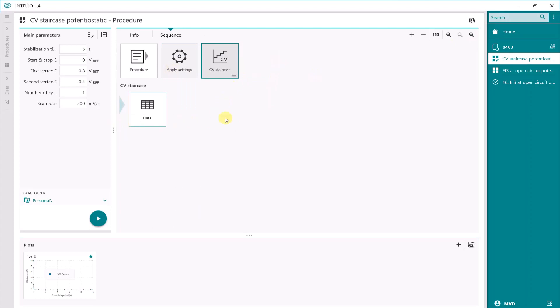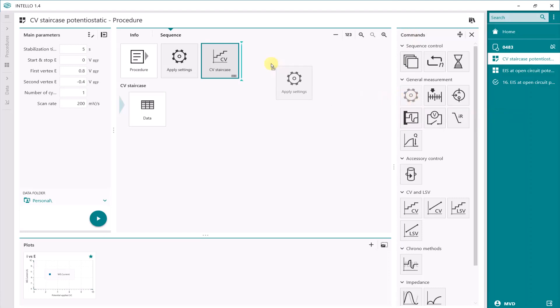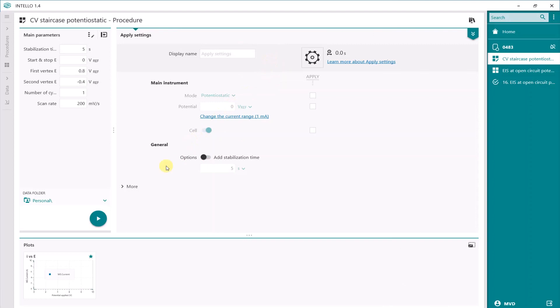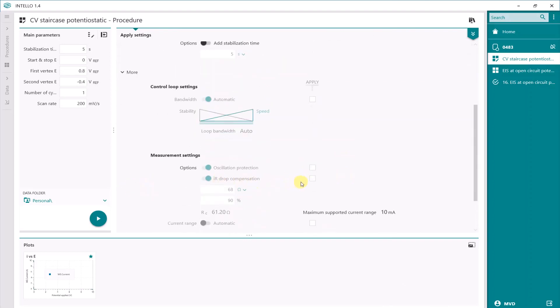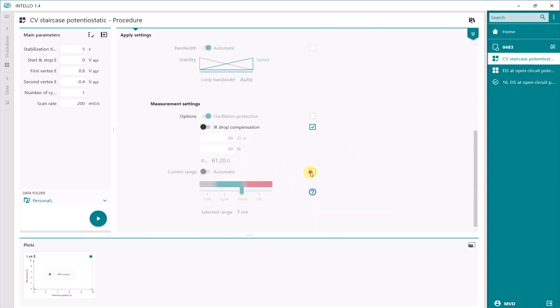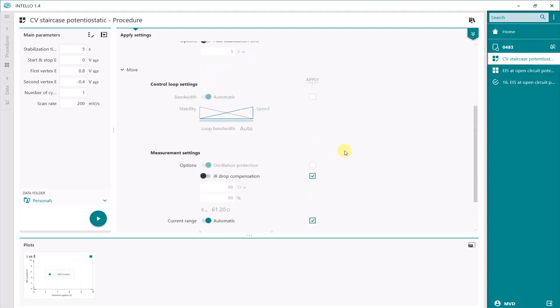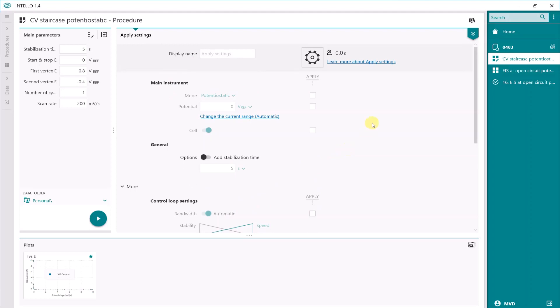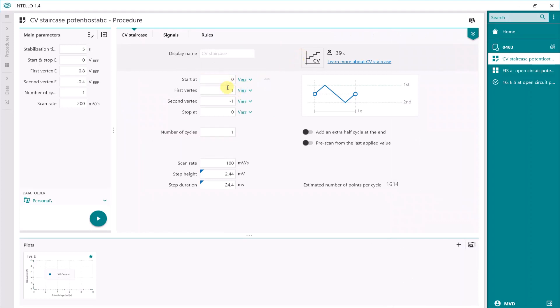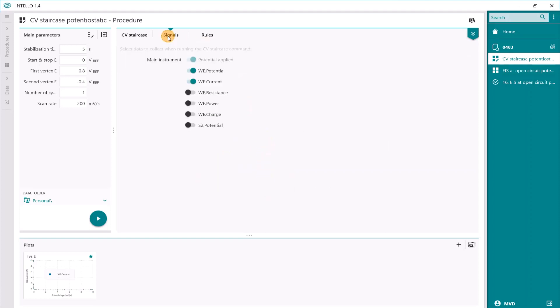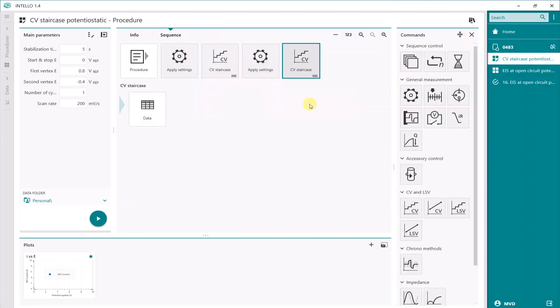We can do that again with another Apply Settings command, putting in another CV staircase command as well. In this second one, we do not apply IR drop compensation — we switch it off — and then we can enable automatic current ranging. So the next CV is just to compare results with each other, using the same parameters: 0.8 to minus 0.4 volts and the same scan rate. These are the settings of two measurements one after each other — one with IR compensation and the other without IR compensation.